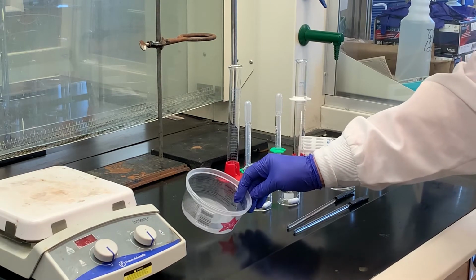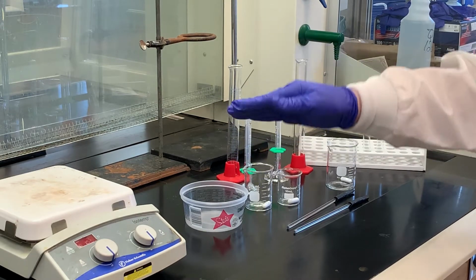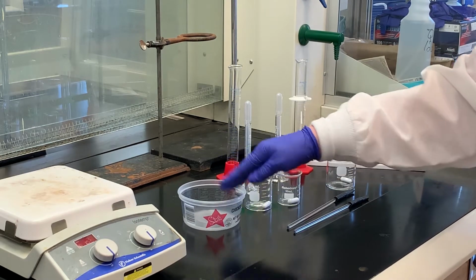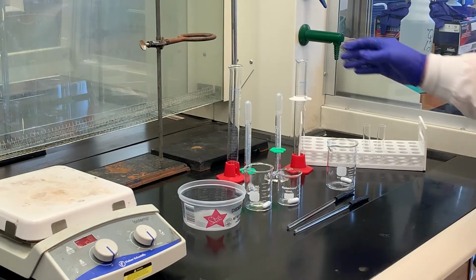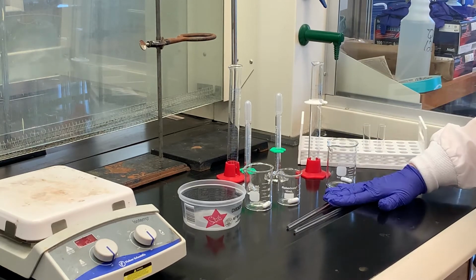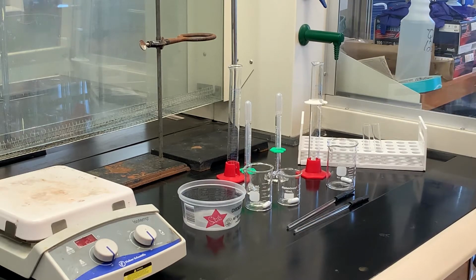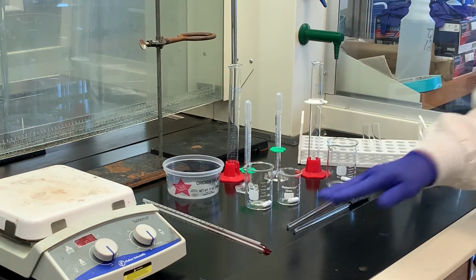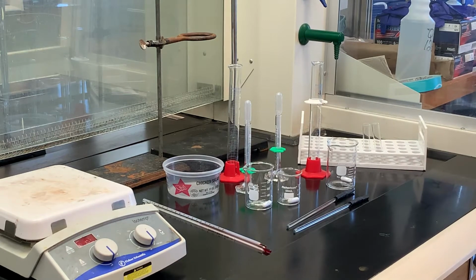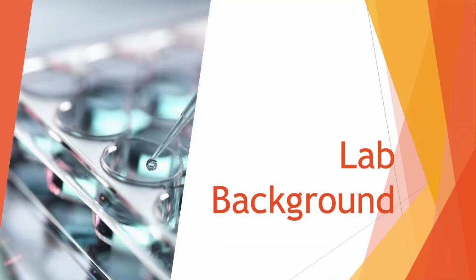I'm going to use just a plastic container here so that I can put this on the hot plate and stir it. We're not using the hot plate portion, we're using the stirring portion, but this needs to be with ice in it. And then for the coupling component, we'll need the graduated cylinder and a beaker, a couple stirring rods. We're also going to make the dye stuff in some test tubes, so you'll need 1 or 2 test tubes there. And then fabric, which we'll get later when we're ready for the dyeing process. And also a couple of thermometers just to make sure we keep the temperature of the diazo component down to around 0 to 5 degrees.